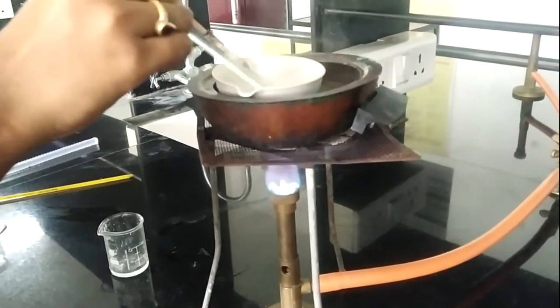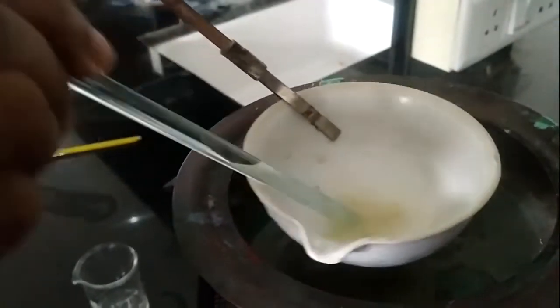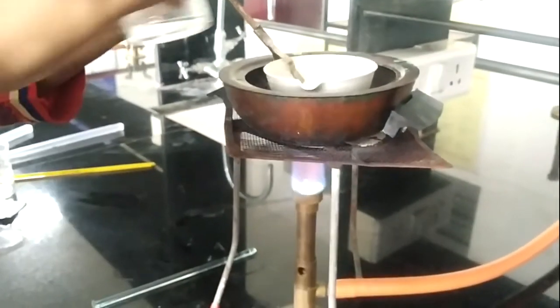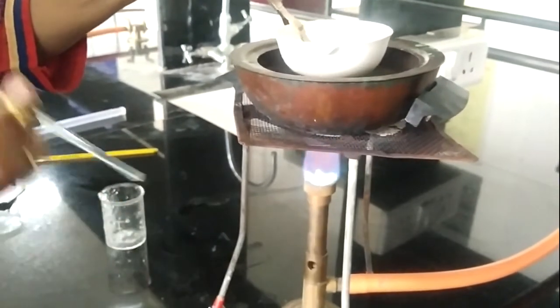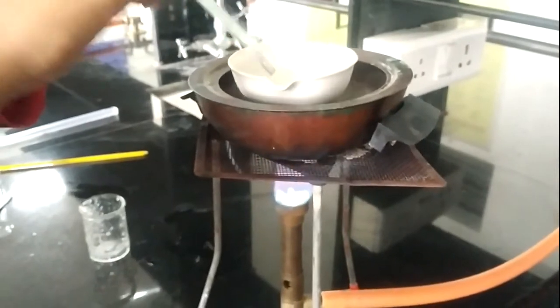Let's see, our base is going to melt, so we will wait till the base melts completely. As our base is completely melted, now I am going to transfer this eucalyptus oil into it and then stir the mixture for proper mixing of both theobroma oil and eucalyptus oil.